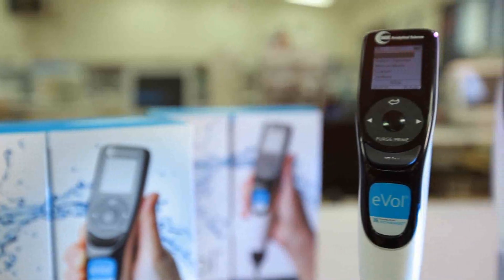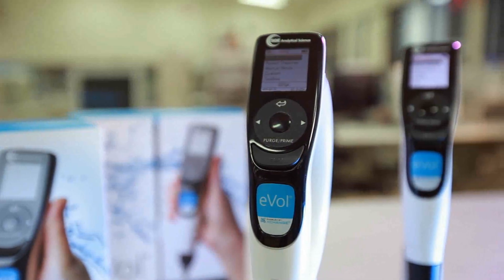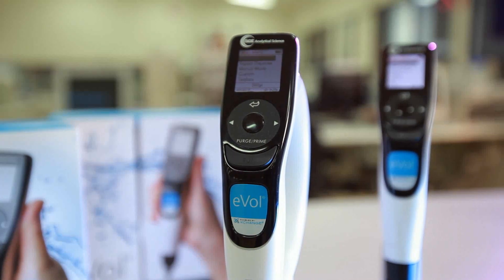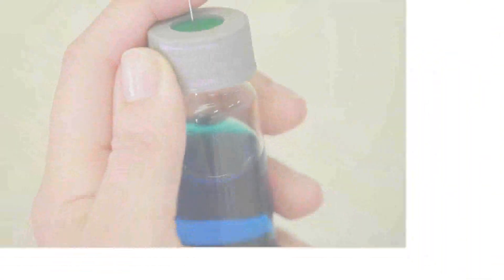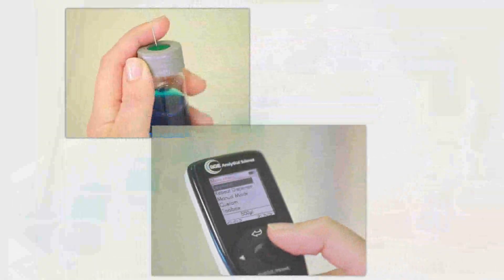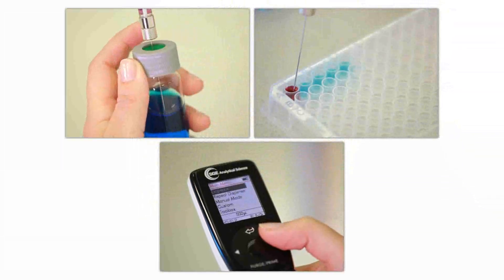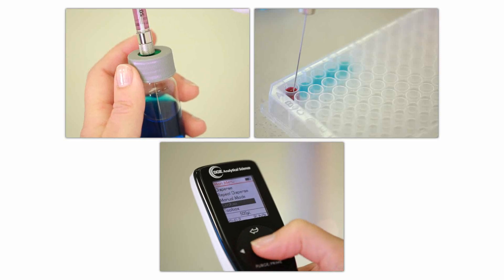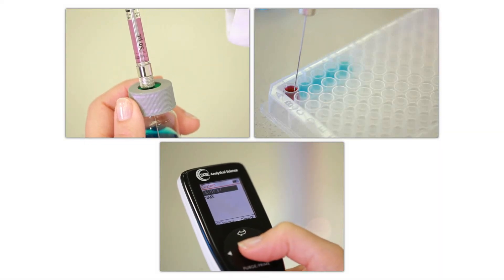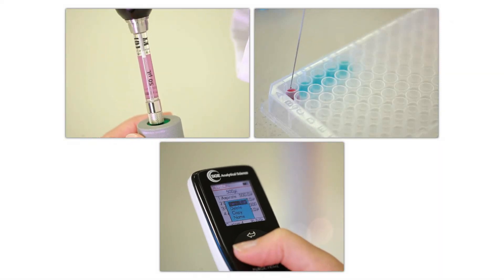Congratulations on your purchase of SGE Analytical Sciences' state-of-the-art EVOL Digital Analytical Syringe. By now you have already experienced the excellence of EVOL's unique features for simplifying laboratory processes while maintaining and even improving the reproducibility and accuracy of your results.